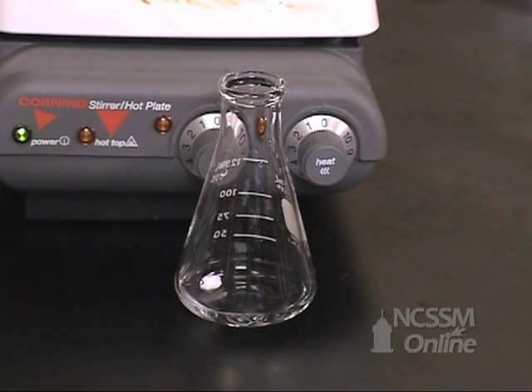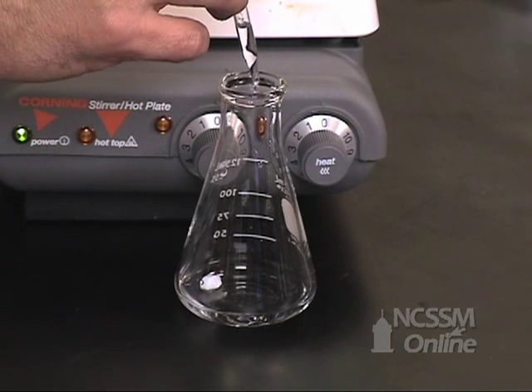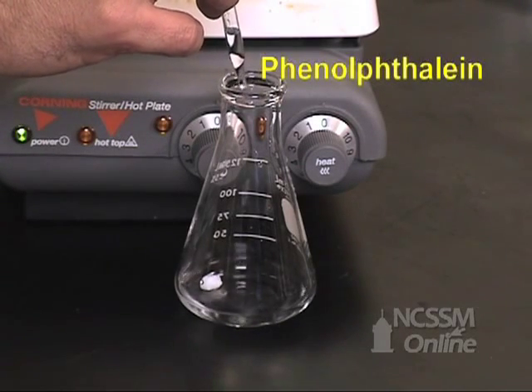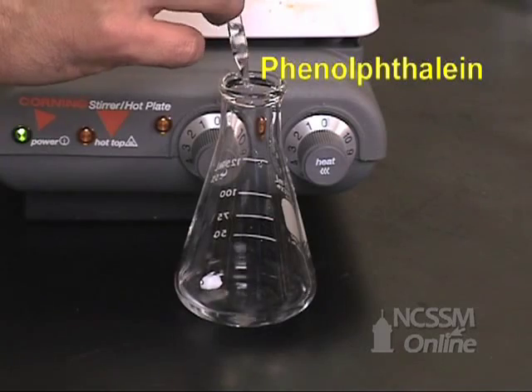We are going to use phenolphthalein as our acid-base indicator, so we are going to add a few drops of phenolphthalein. The solution is acidic, so the solution is colorless at this point.